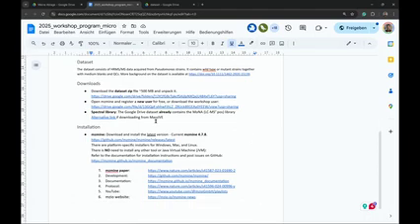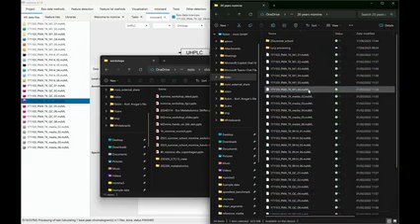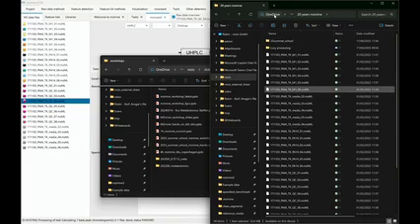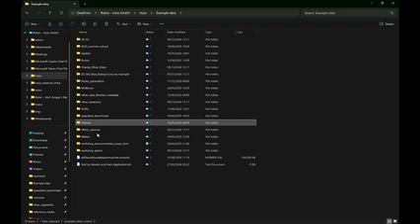So there was the spectral library, and it's the MoNA spectral library. There are a lot of different libraries you could use: GNPS, MassBank North America, MassBank EU. They try to exchange spectra, but they still have a different coverage sometimes, and they have different routines of filtering out spectra. But in general, all of them work. And I just have to find it myself, so you can already try to select the library.